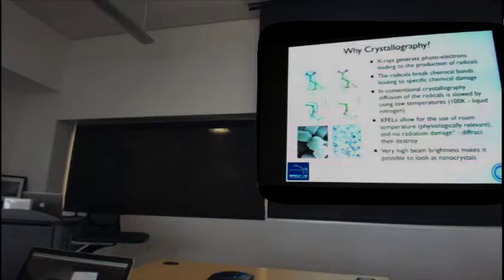The great thing about FELs, and this was based on a lot of theoretical calculations and ultimately experiments, is that we can deliver the photons in such a way that we get diffraction before we get any of these damage effects. Although I will say, I've said here no radiation damage. That's not really been 100% demonstrated, I would claim. There's a lot of evidence to support this, but there are still experiments ongoing at the LCLS to try and actually really definitively prove that there's no damage. But the signs are good.